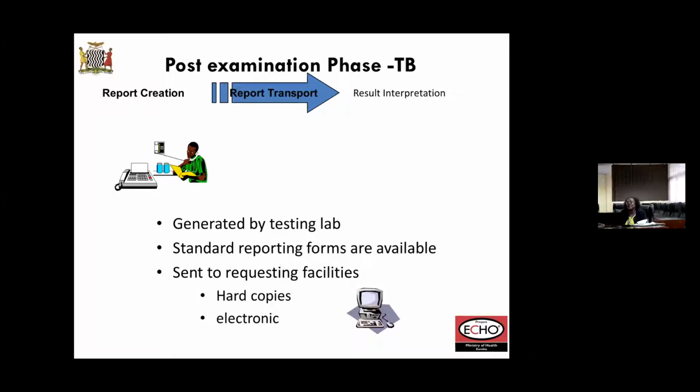which registers samples here at UTH, for example, let's say Kanyama first level, is it District General Hospital now? You would only be able to access the results for Kanyama because that is the credential that you have been given. So anybody, anywhere within Zambia, as long as you send samples to UTH and your facility is on our system, you are able to get your actual results.